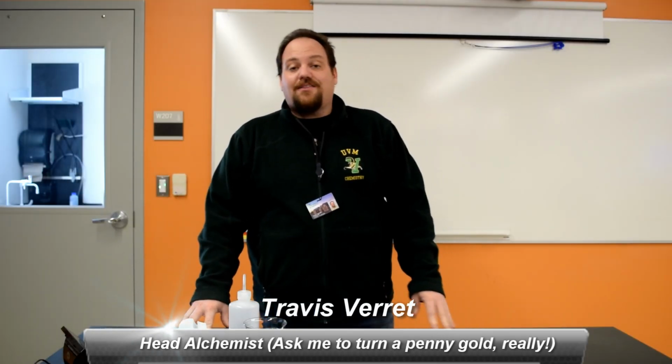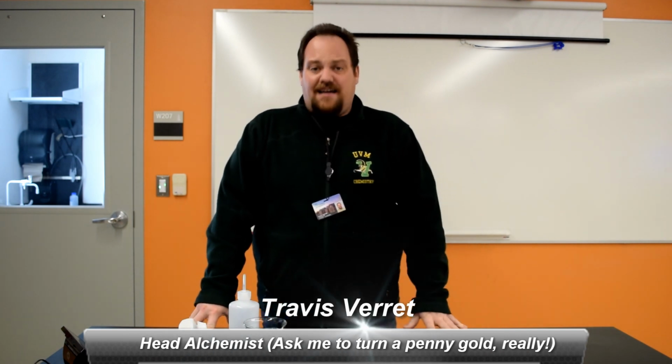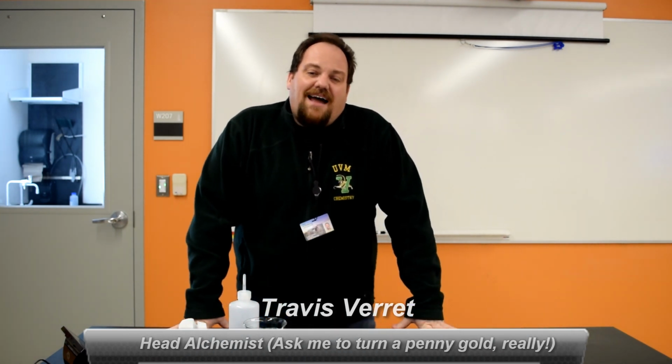Welcome, and in this week's lab we are going to be talking about the reaction rates of iodine. Now, I like to think of this lab as kind of like baking. When you change the temperature of what you're baking and you change the ingredients of what you're baking, you get different results. And that's what we're going to be looking at.